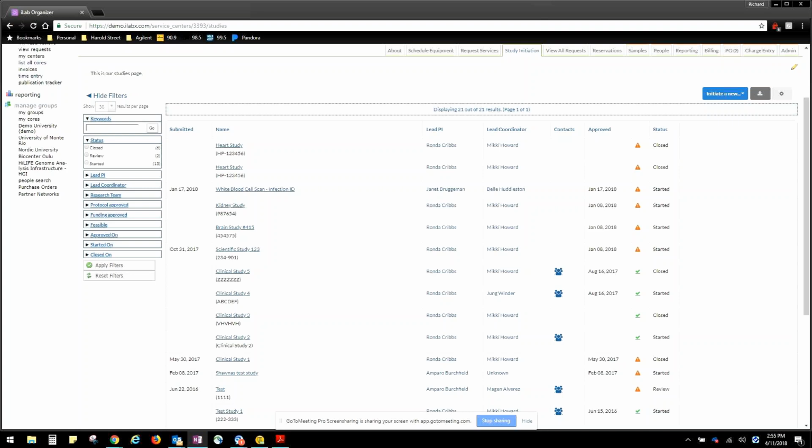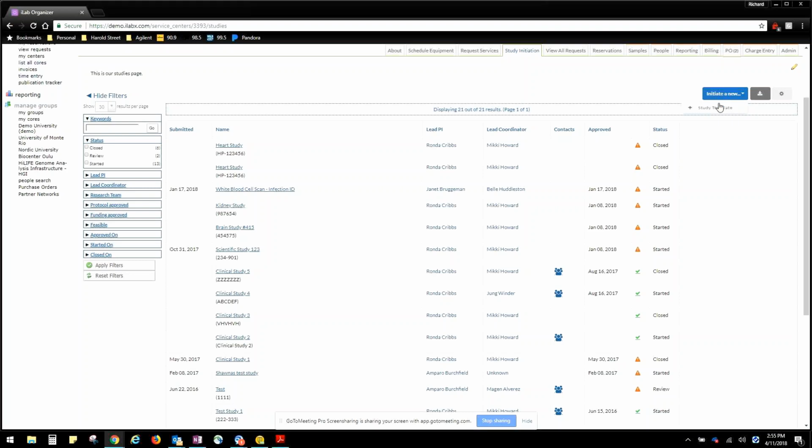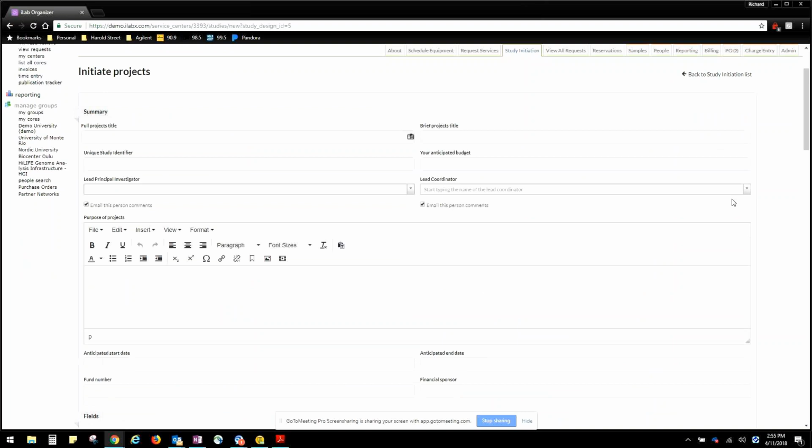I did want to say, I'm not entirely sure, well, this might be something new that you're aware of that I'm not. As far as turning off those sections, I think it is pretty limited in what we can turn on and off, such as we can turn off the subject sections and the cost analysis section. But most of those aren't required fields. Really, all you have to fill out when you're submitting a study is the lead PI and the full study title. So if you don't want to use that summary section, you can ignore it. You don't have to use the new unique study identifier, or if you have a specific name for an ID, that is actually a field where we can rename that unique study identifier. Maybe it's called, I don't know, the Penn State ID, PID. We could rename that field PID for you. So that's just the only thing off the top of my head that I wanted to add.